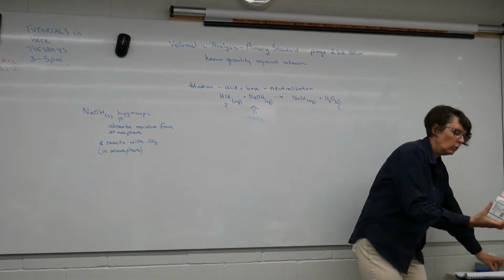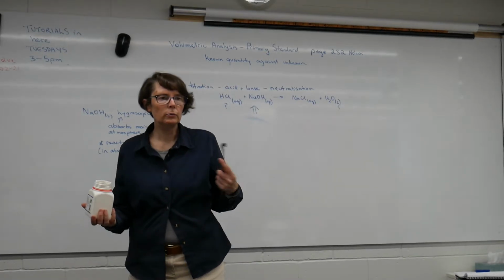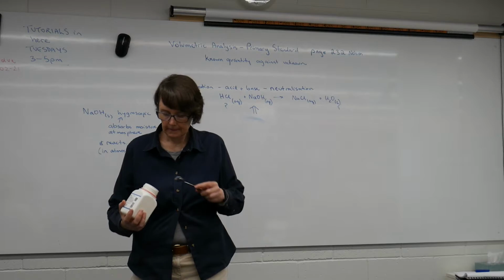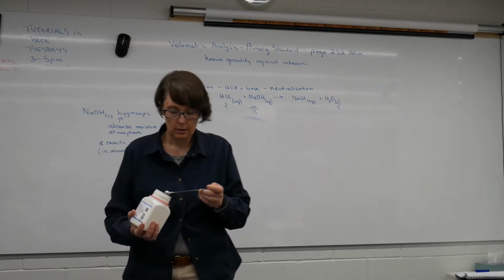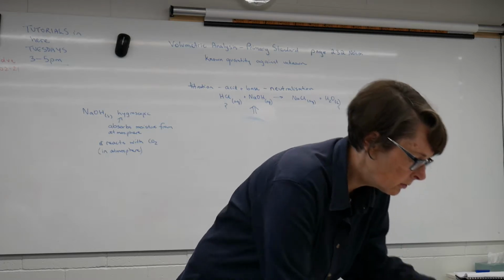Now, we know it's highly corrosive, and if you rub it in your eye, you'll be permanently blind because it causes the cornea to go cloudy. So don't do that. Just going to be looking at them.